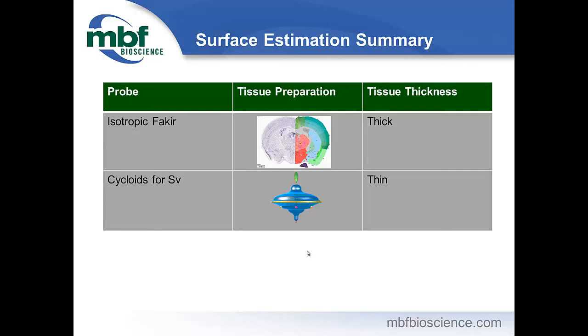Okay. We just got a question going back to length, and it says, can you clarify why Spaceballs is a probe for length but not density? So we are probing for length, and we're using a surface, and the basic idea is that the more intersections you get of the fibers or the blood vessels with the surface, the longer they are.